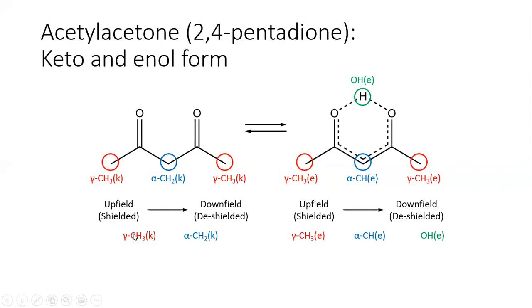All right. So now once we know their relative positions in the NMR spectrum, we should also check the proton ratio, because the number of protons in each group correlates to the intensity, or the area under each peak in the NMR spectrum. And also their multiplicity. So how will the peak split? Okay, so let's start with the simpler one, the proton ratio.